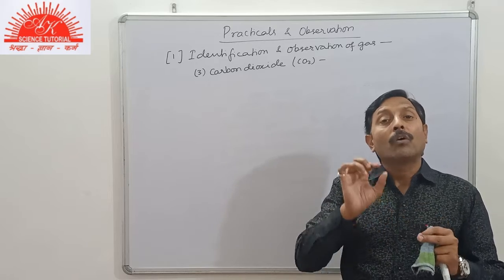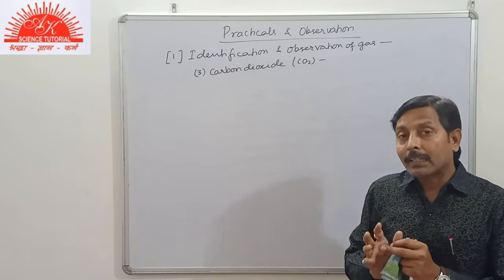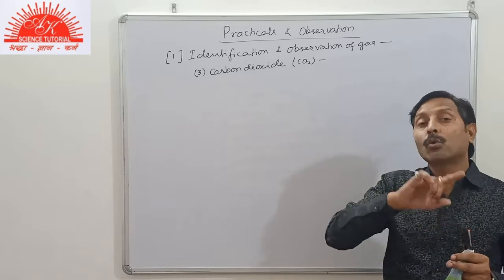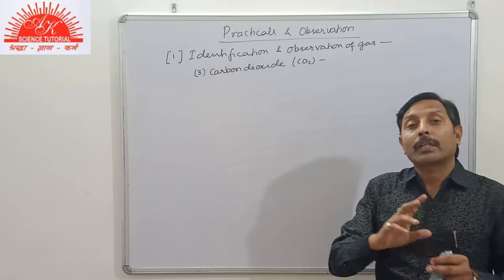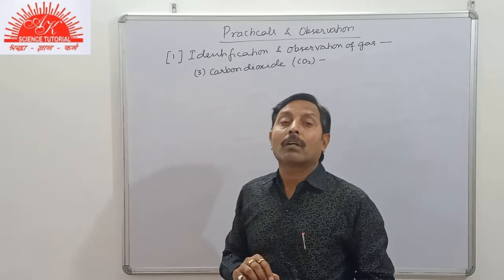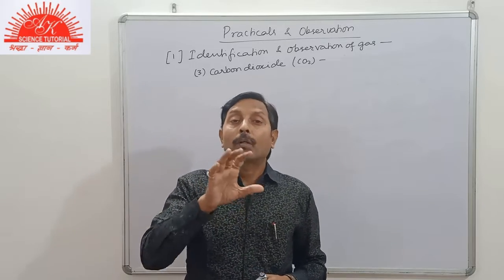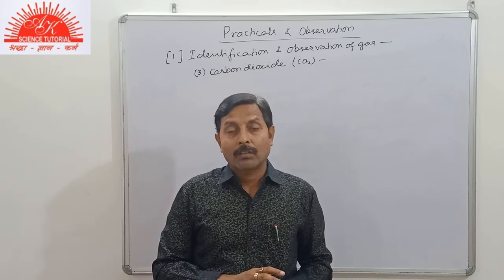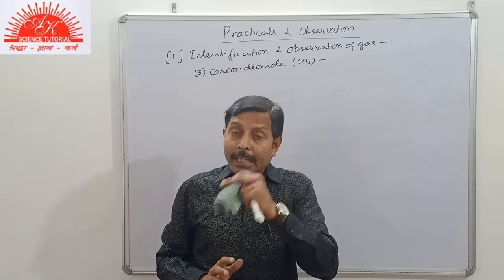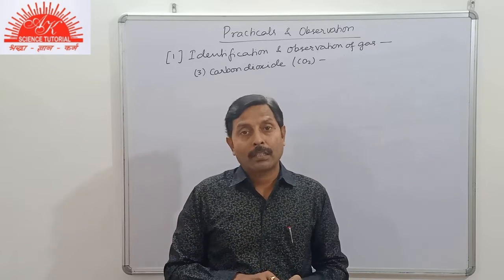As a result, we write here that the gas has no effect on acidified potassium dichromate solution or alkaline potassium permanganate solution, which will be changed by SO2 gas.